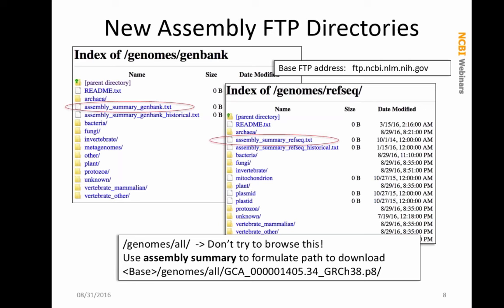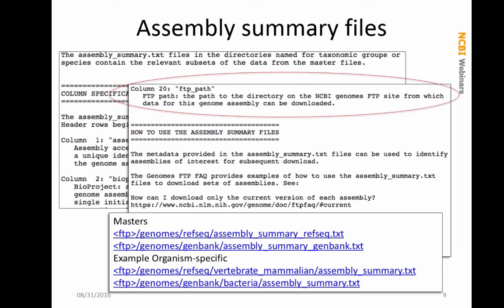In the FTP directories, the genomes_genbank directory is on the left and genomes_refseq is on the right. You can see the organization by groups of organisms. Within those there are assembly_summary text files — these are the files where you would go to get the paths to download data, and you can see examples on the Genome Downloads FAQ. Today I am going to show you how to get those paths using eDirect. One of the most useful things in the assembly summary file is column 20 in that tab-delimited file, which is your FTP path.